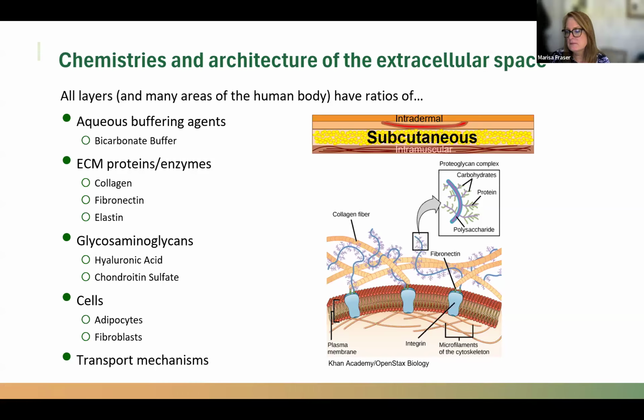Okay. What was the membrane size of the cartridge? And was the esterase only confined within the cartridge and not diffused into the larger chamber? Yes. So in this experiment, the esterase could diffuse into the larger chamber. We have a 5-micron pore size on that membrane.